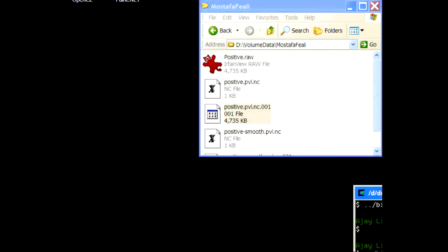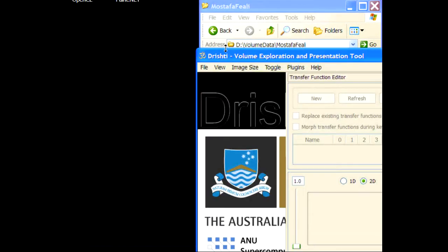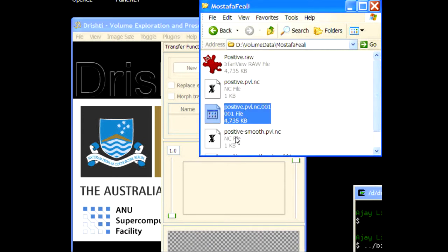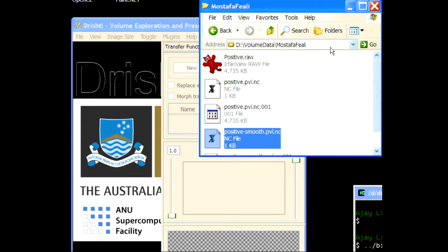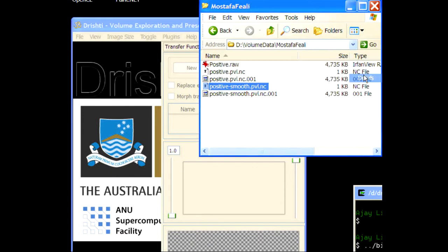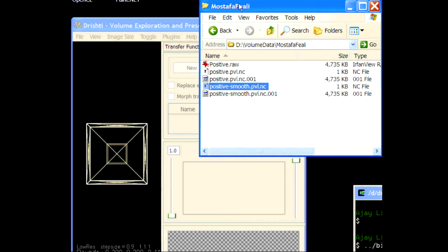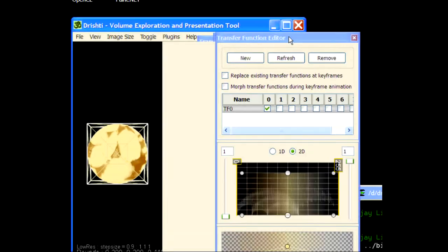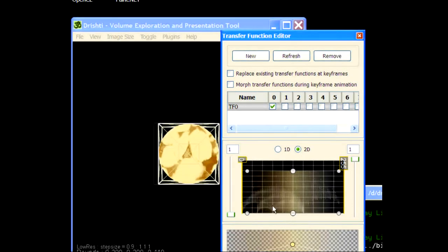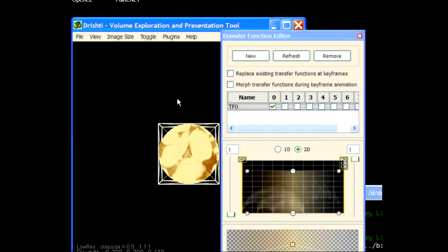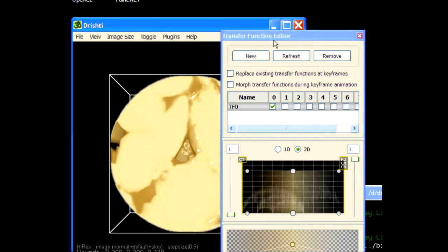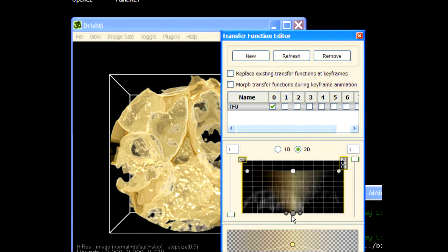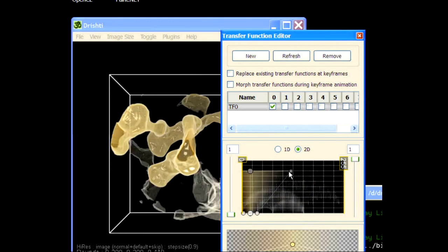Let me quit here and again, I'll run Drishti and drag and drop this file. Drag and drop that and you'll get smoother. You can see these arches here and you can then easily catch these arches here.